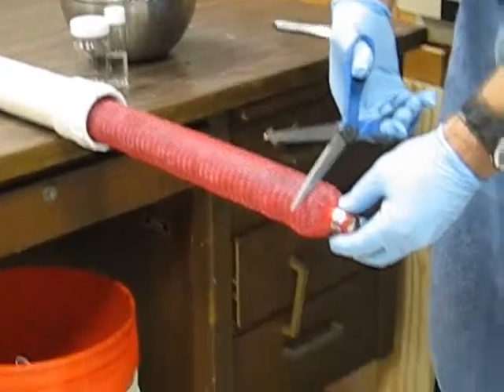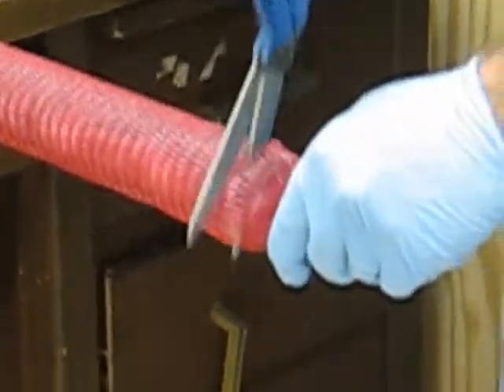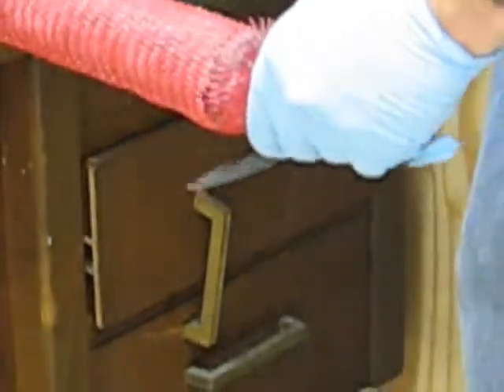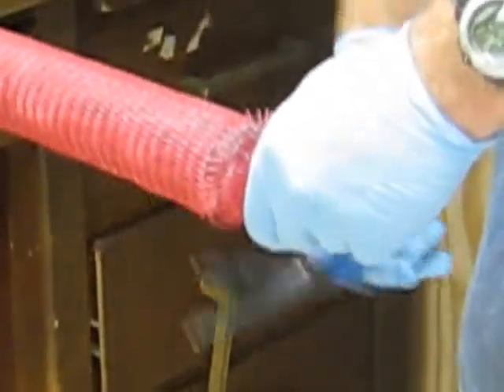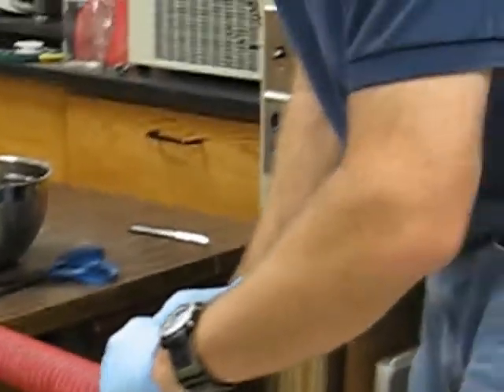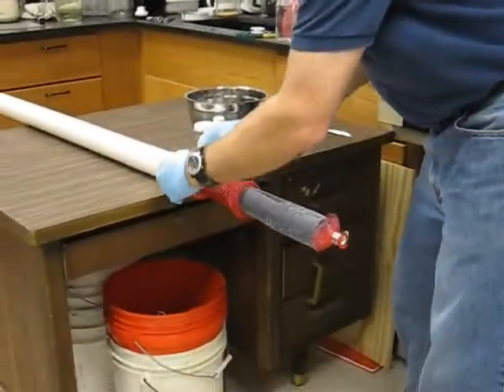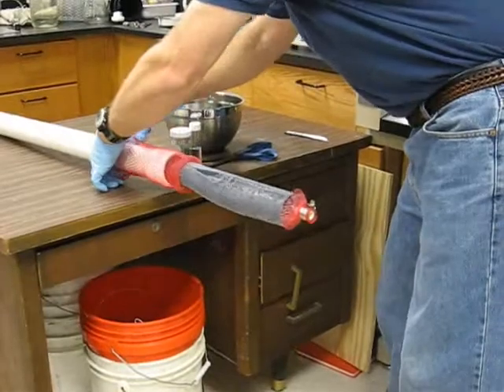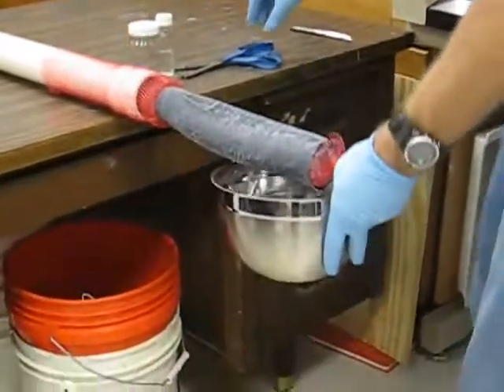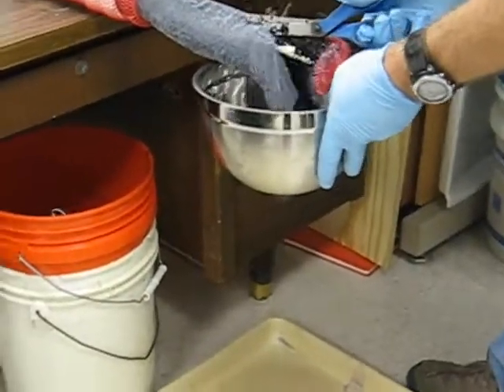I'm going to go ahead and start cutting this — right into both the red mesh on the outside and the nylon mesh in the middle. Then I'm going to grab the red mesh and peel it back. This is probably the easiest way to do it, though you can also just cut it. Now I'm ready to catch all of the activated carbon in a bowl.